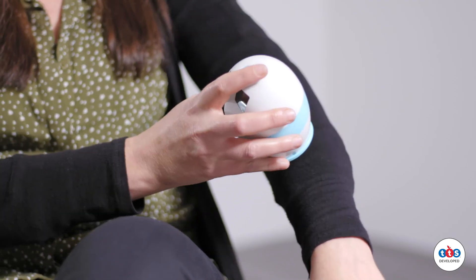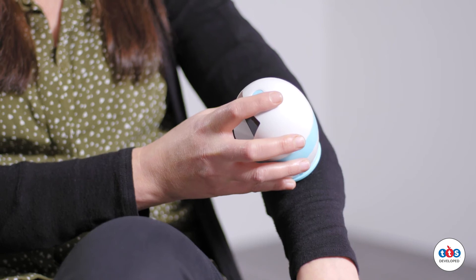Simply hover the microscope over the object which you wish to magnify and you can see the object at 43 times magnification through the screen.